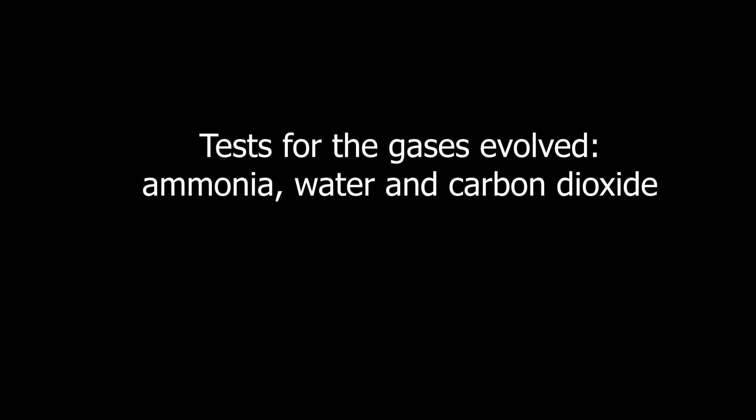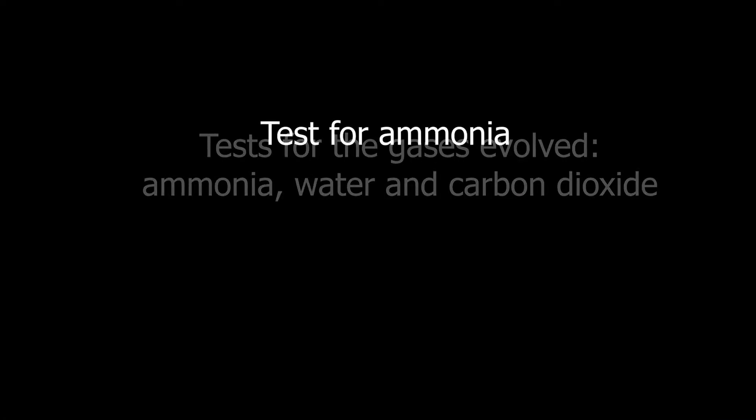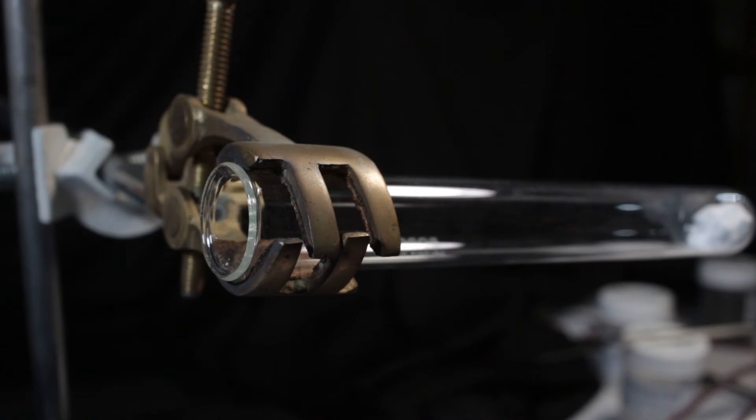Now let's check for the presence of ammonia, water, and carbon dioxide in the products of decomposition. Starting with ammonia first. It's going to be easy, because another name for ammonium carbonate is smelling salt.